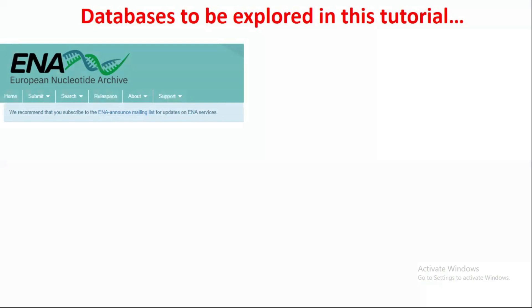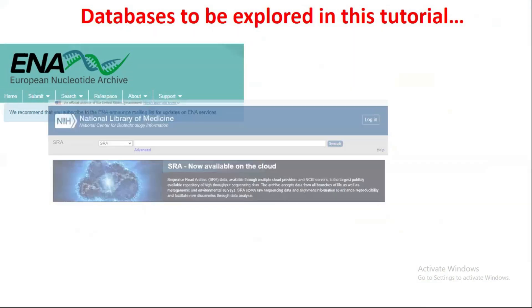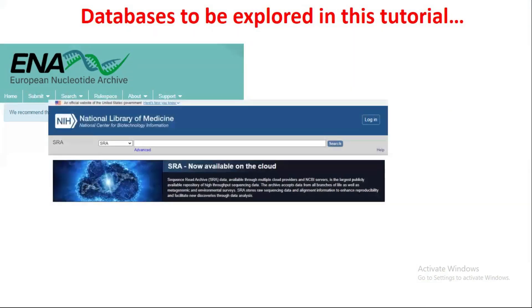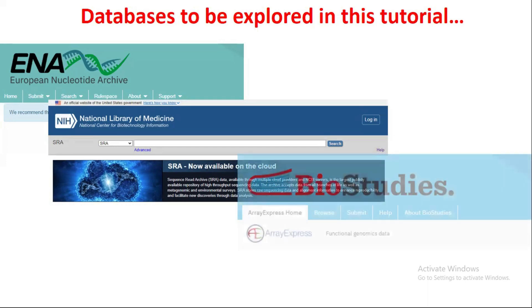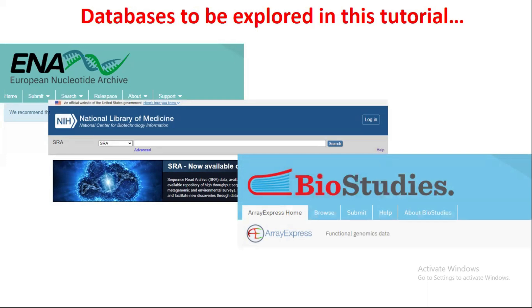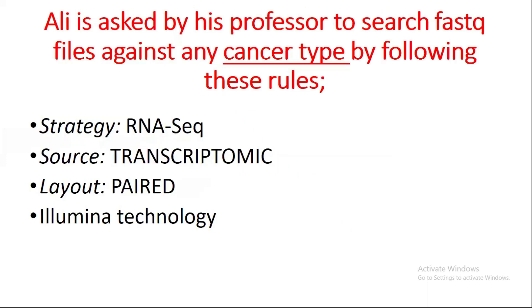After ENA, there is the SRA database linked to NCBI, also known as the Sequence Read Archive database. The third is ArrayExpress. These three biological databases are interconnected with each other — a type of integration — and you can also use them individually to find your data of interest. Let's proceed with the practical.